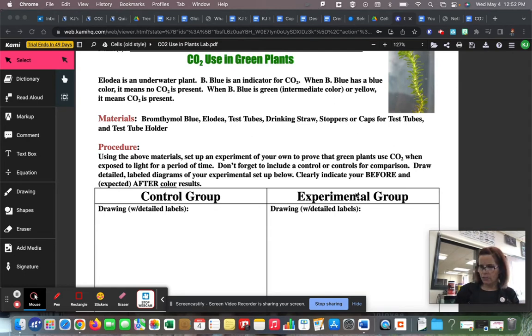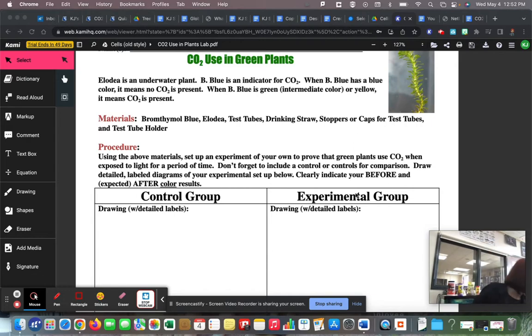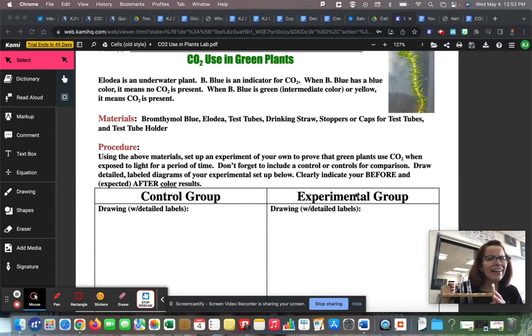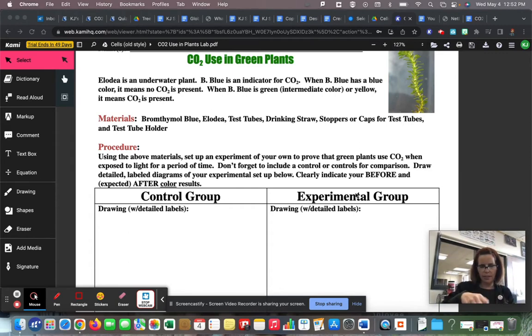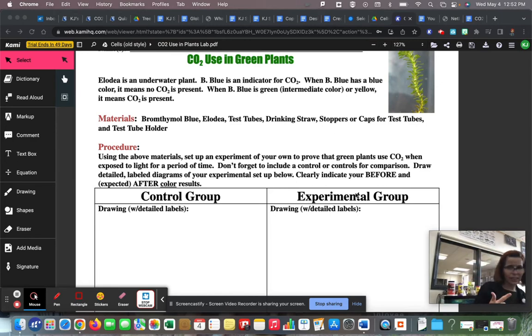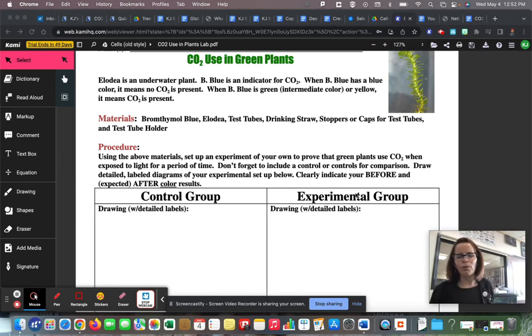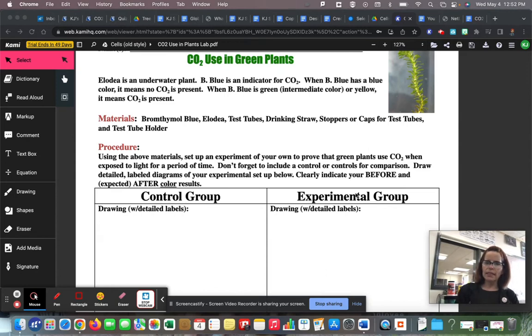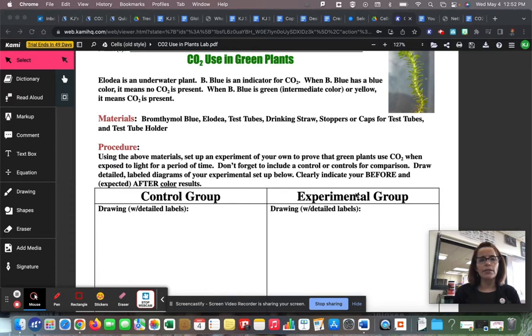These are the materials you get: bromthymol blue and the underwater plant, some test tubes, a drinking straw, some stoppers for putting in the test tubes, a test tube holder for holding the test tubes, and a sunny window for photosynthesis. It says: using the above materials, set up an experiment of your own to prove that green plants use carbon dioxide when exposed to light for a period of time.